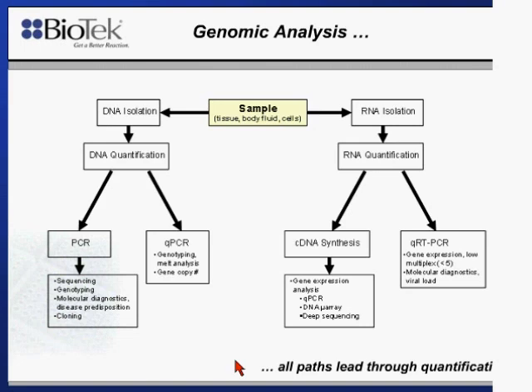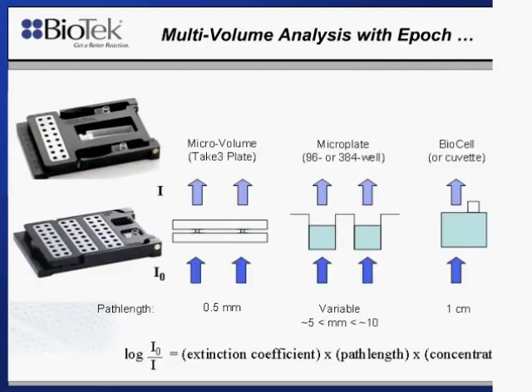So microvolume analysis. Here I'll introduce you to the microvolume microplate that BioTek offers, and I'll do a short comparison between the other methods that are currently used, such as 1 centimeter path length vessels, as well as microplate vessels, which most folks are probably familiar with as well. And a lot of this work was done on a standard absorbance microplate reader.